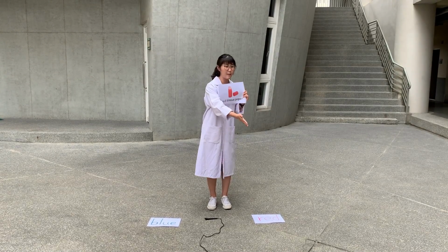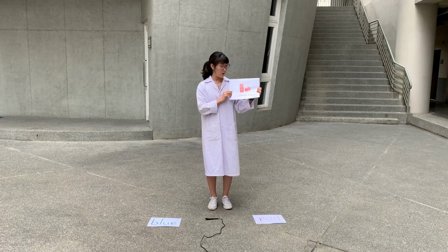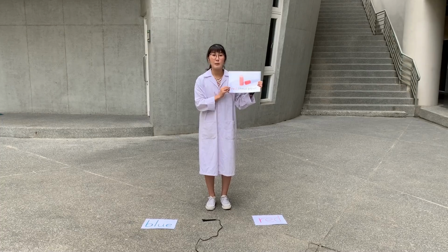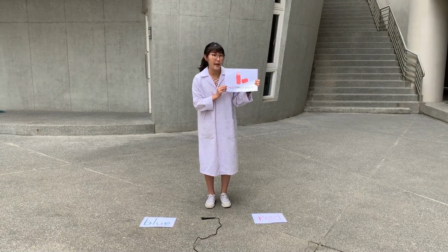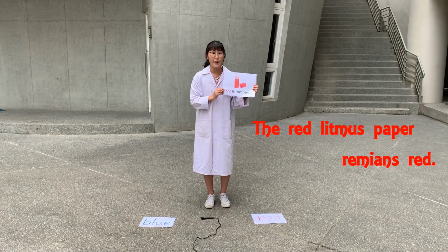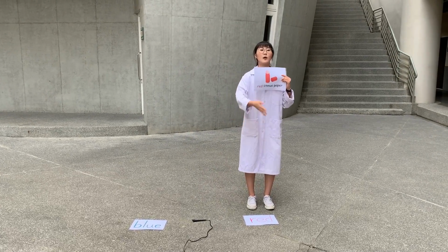Okay, I see some of you are here and some of you are standing here, okay? So, coffee is acidic. The red litmus paper remains red, okay? So, the red side is the winner.